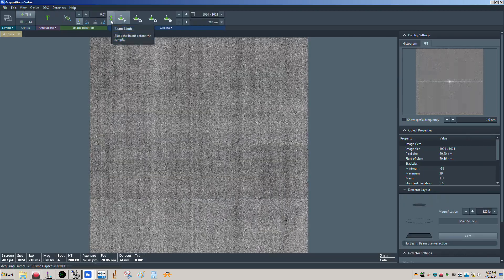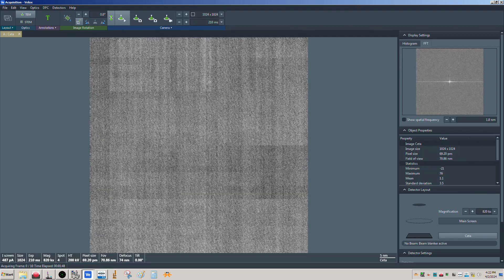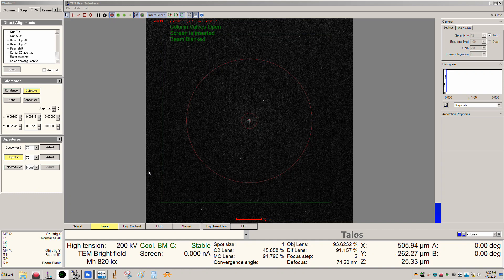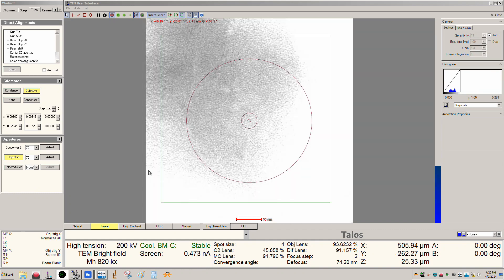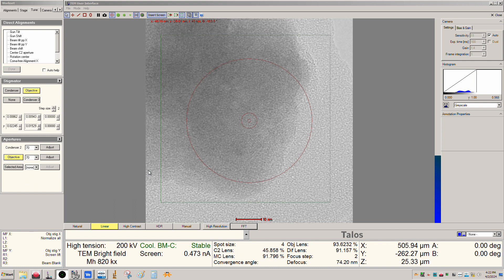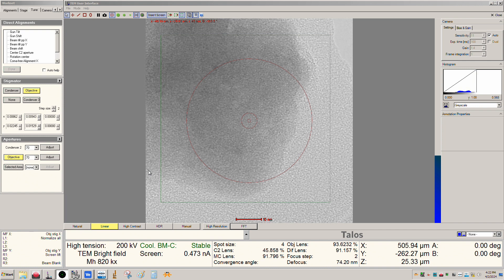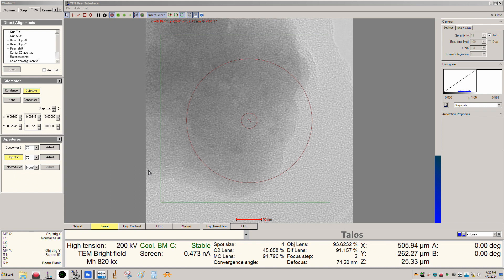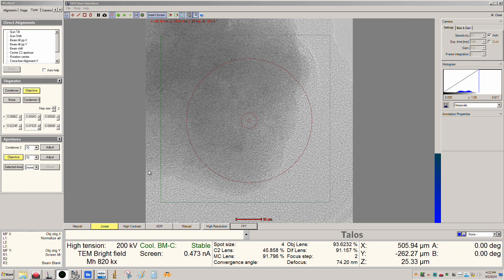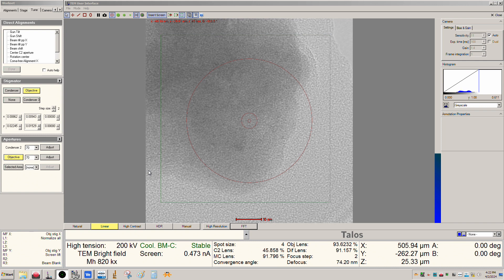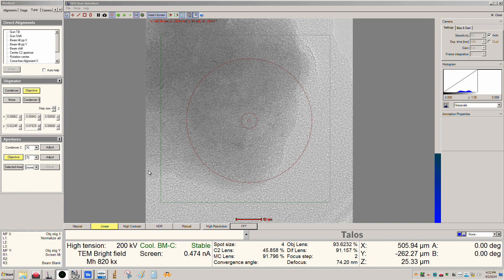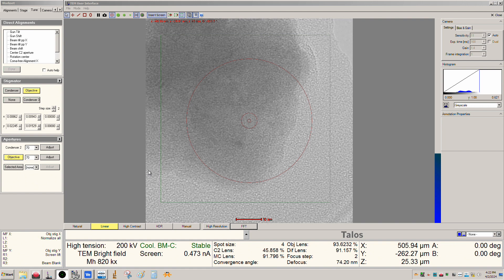We see a little bit of beam drift, which is normal in MH mode. That is the use of the DCFI function in TEM mode, as promised. Sorry I'm a day late, but if you have questions or comments please leave them below. Looking forward to getting more videos out soon. Take care, everybody.